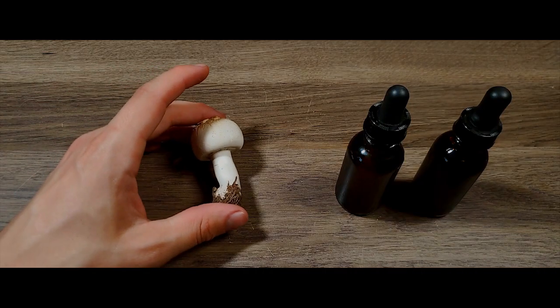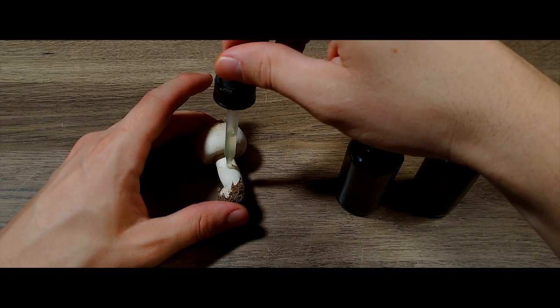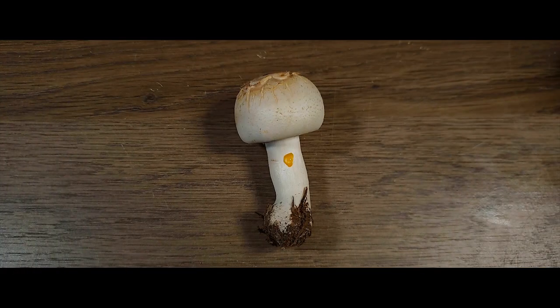Moving on, we can test for a couple of reactions. 10% potassium hydroxide, or KOH, is a common reagent used in mycology that, when applied to certain tissues, often produces color reactions that are highly valuable taxonomic markers. Here you can see the mushroom is staining a distinct yellow color from the KOH. This reaction is listed in most field guides for each mushroom.